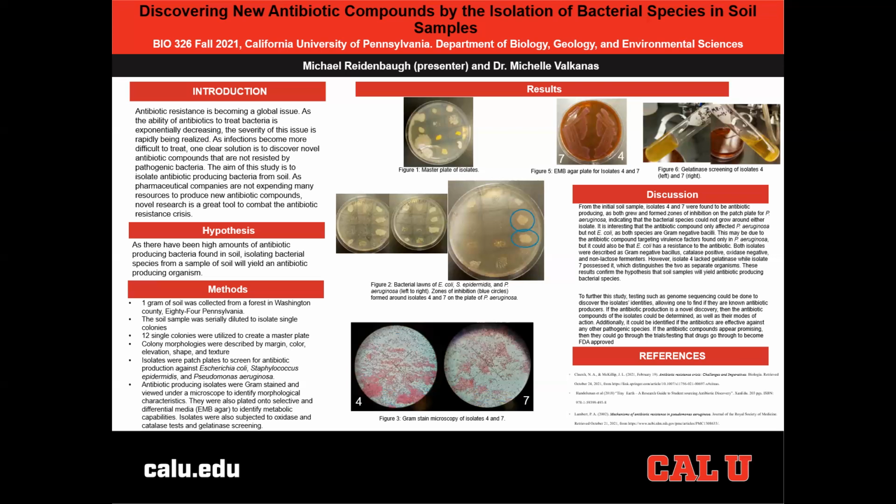Overall, this study was a success, and it showed that antibiotic compounds can be uncovered from soil samples. And it's quite significant that we can find antibiotics from soil, since resistance is becoming a big problem, and students across the world are just able to discover new antibiotics. It's a numbers game. If everyone begins to look for antibiotics, then we may just find them, and we would be able to treat a lot of diseases quite easily.